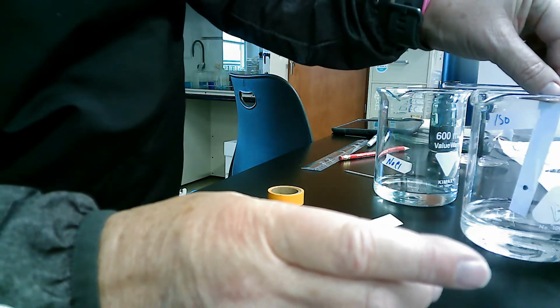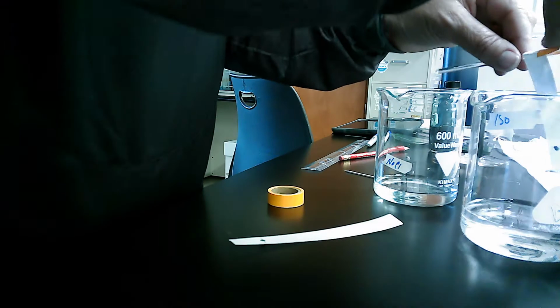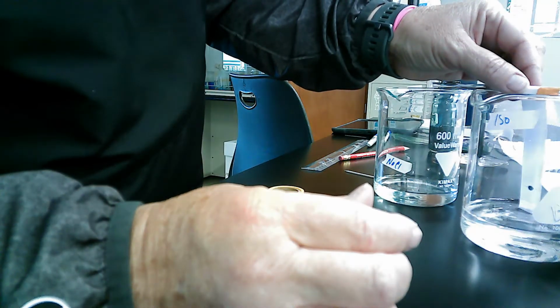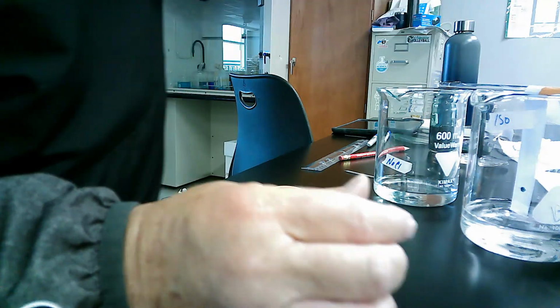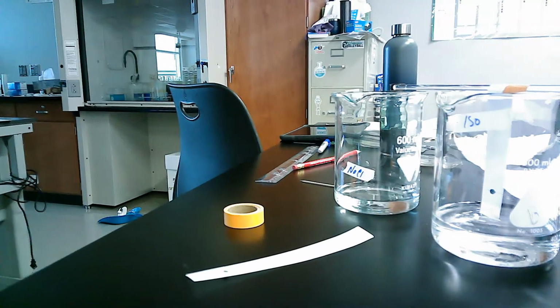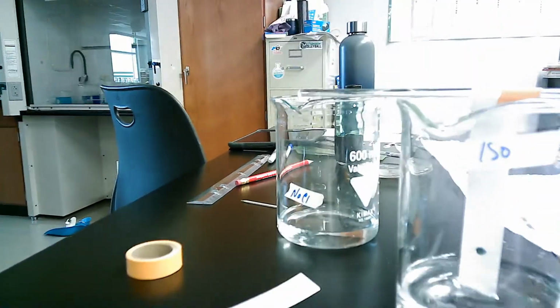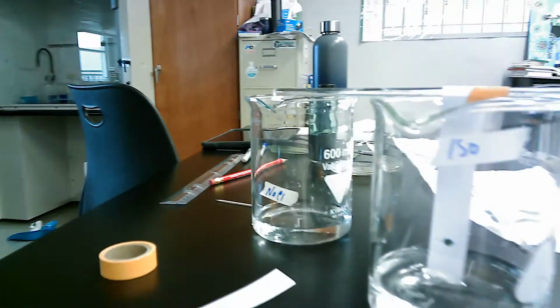the paper, which I'm not quite there, so I'm going to go a little bit farther down. Still not quite there. Again, like I said, it's a balance between not going too far, but going far enough. All right, so there I can see that it is touching the paper. Close, I can see that it's touching the paper, but it's not touching the dot.